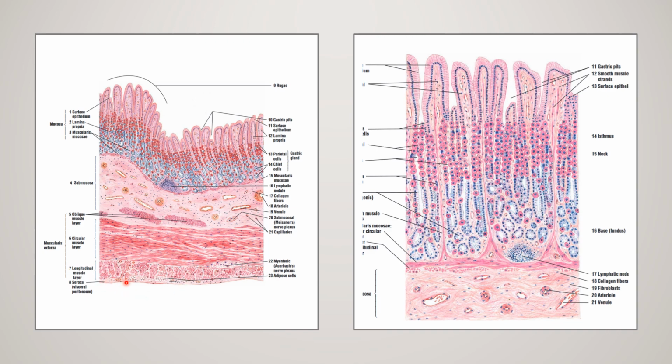If you come out, you will have the serosa. Here the serosa is the peritoneum lining the stomach. It is a thin layer of peritoneum you can make out. There the lining epithelium is simple squamous epithelium. Already you have studied that the simple squamous epithelium lining the serous membrane is called mesothelium. So these are the features of your stomach fundus.